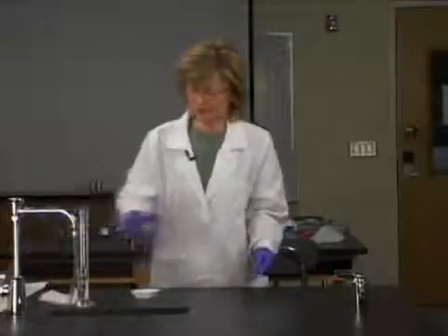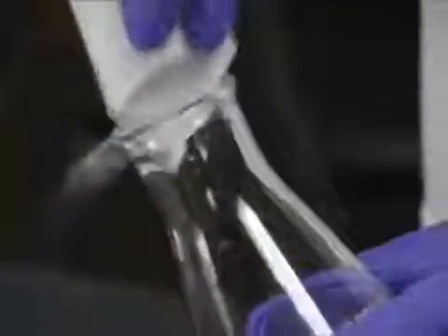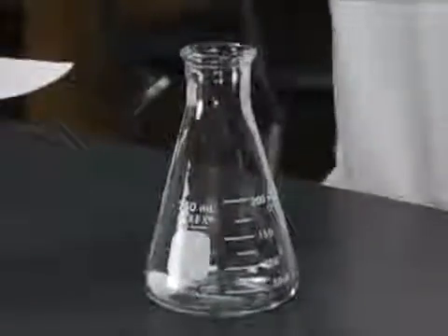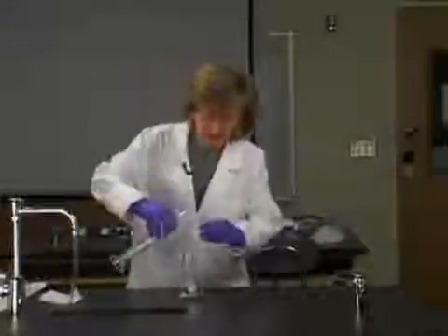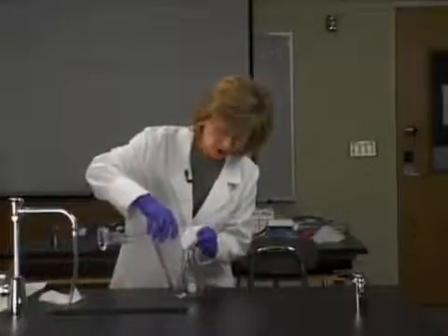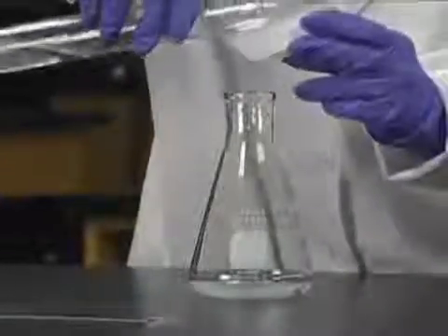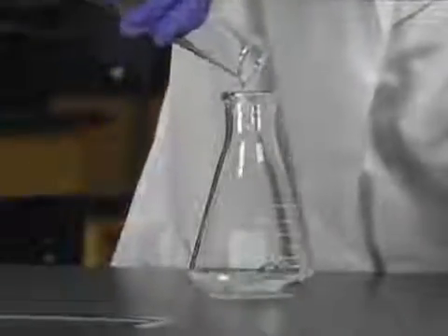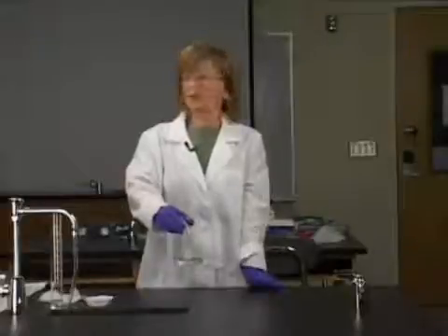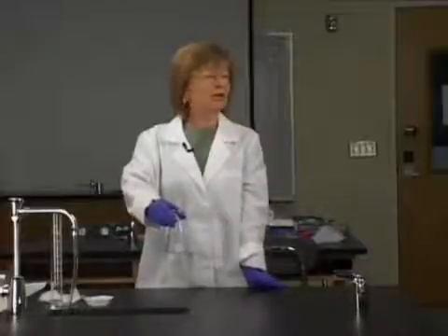So I have here a 250 milliliter Erlenmeyer flask. I'm going to pour the agarose into this flask. And I have my 1 times tris borate EDTA buffer that I'm going to put into the flask. I'm also going to wash out the weigh boat with the buffer because, of course, some of the agarose has stuck to the weigh boat. There we go. We have to melt that agarose, so we're going to take it to a microwave. We're going to microwave it on high for about 40 seconds till it boils, and then we're going to come back and pour the gel.